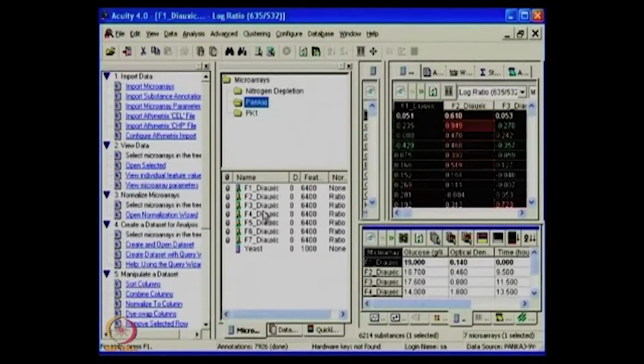Here we see 7 different time points collected, and these are individual slides which one has run with both Cy3 and Cy5. So this is a ratio based image which we are going to see, and we have also got another file which comes from text to show you that it can also be imported. First you have to individually scan each of the images, make one folder where you group all of this, and then use that whole data set for the combined analysis.